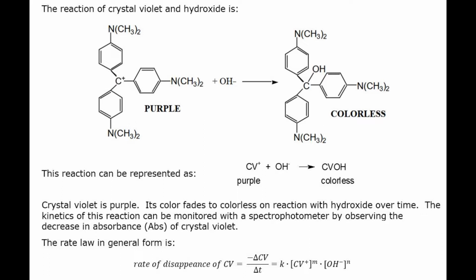Now, the reaction is not immediate. It takes a few minutes, which is useful because we can take advantage of this to measure the rate of the reaction in this kinetics experiment.